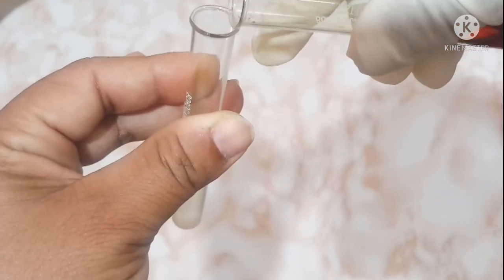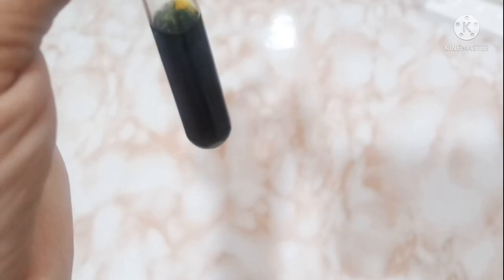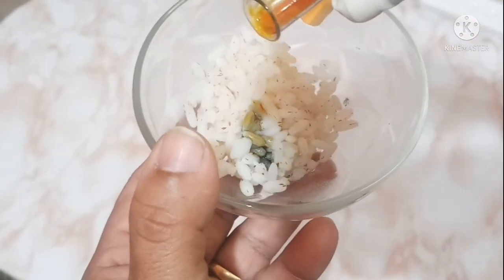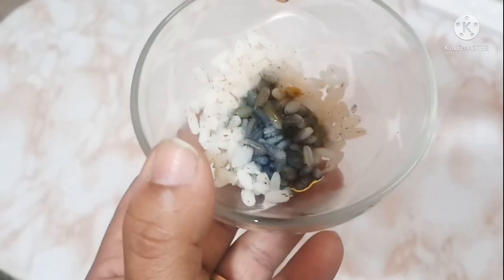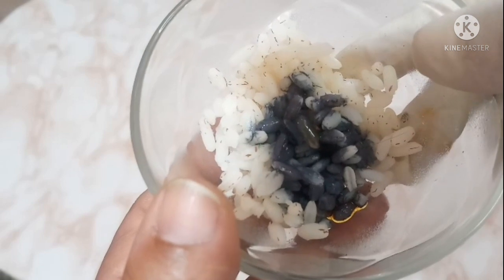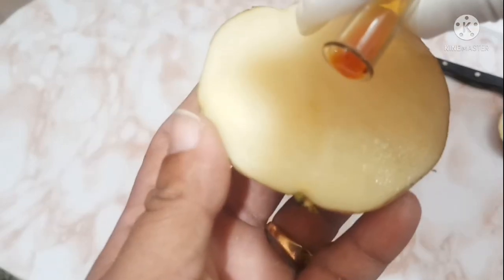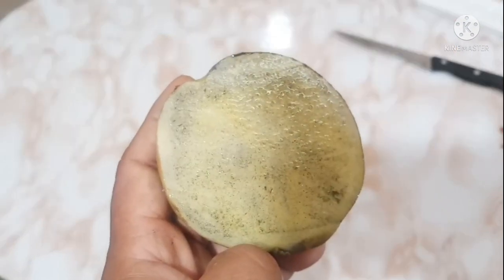Now let us check the color change of the starch solution with iodine. Next, checking rice — the color has changed to blue-black. Now testing the potato — the color change is visible.